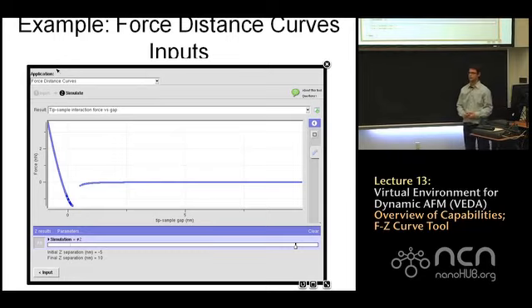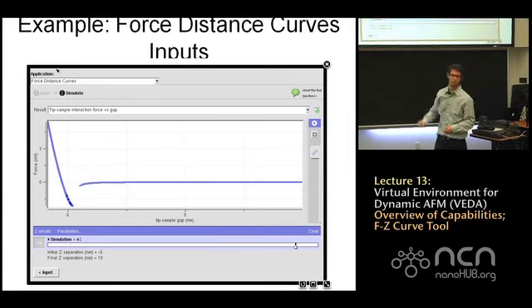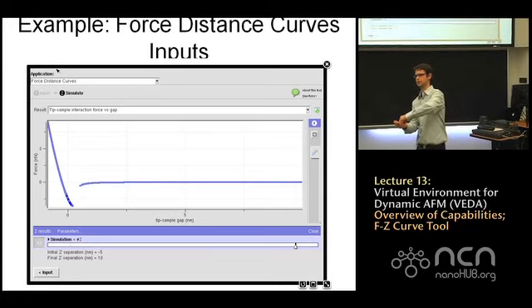And again, if we plot force versus gap, still we have a separation where we don't have any information. So there's still a region where the cantilever goes from contacting the sample as we're retracting, and then it pops off the sample. There's still a range of tip sample gaps where we don't measure any reliable information.